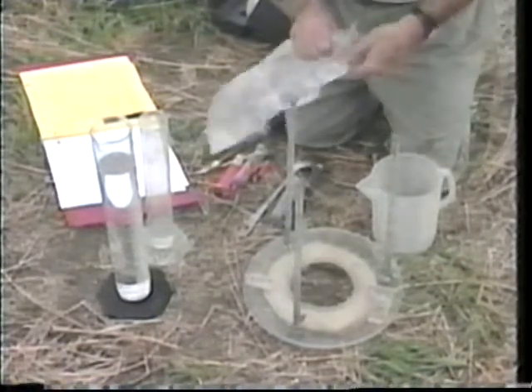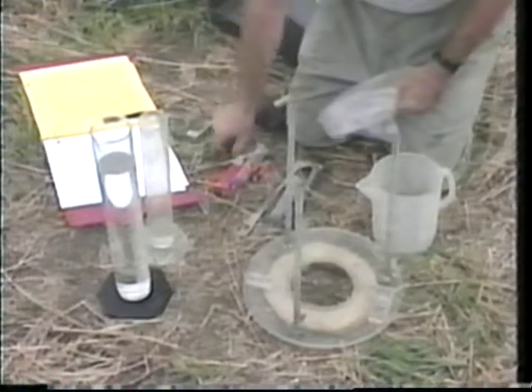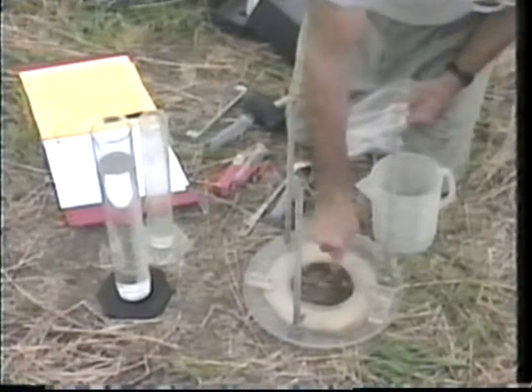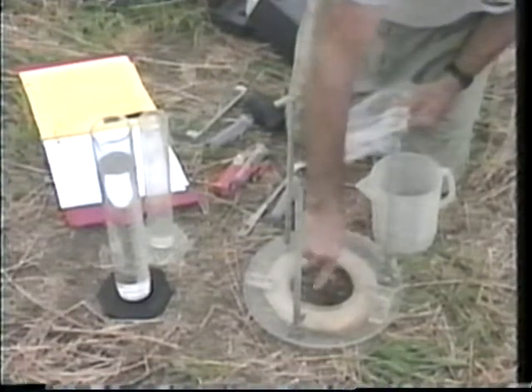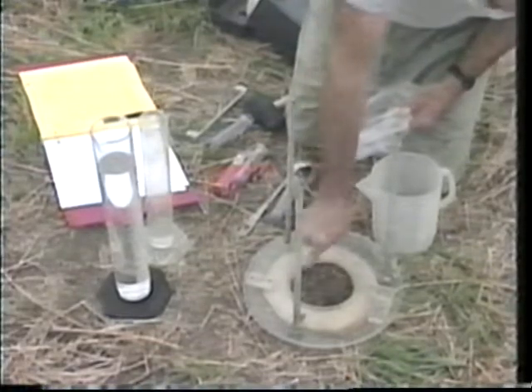Zones as thin as 2 centimeters may be measured, and the immediate surface need not be disturbed. Bulk density is a very important measurement in soils and can be used to predict the rate at which water moves through the soil, the water-holding capacity of the soil, and the air-filled porosity of the soil.